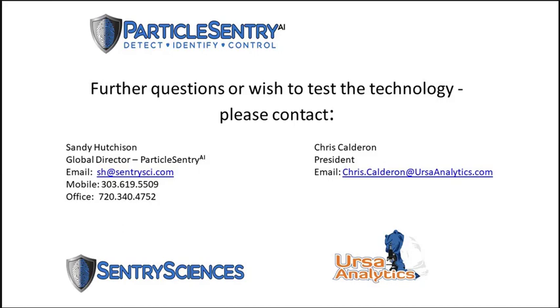One of the themes of this talk was I tried to use the dog and cat analogy and then showing how complex the morphology is in these images. Even subject matter experts have a really hard time finding good quantitative and automatic features that are embedded in the images to make decisions on. So this technique is a really systematic, consistent way of assessing the particles that are coming out of these images. Even though they might be hard for a human to interpret, this is an algorithm that is going through and processing in the exact same way. It's not like someone gets tired in a visual inspection type thing where humans are looking at this. This is a completely digital automated technique, and we see that being an advantage over humans looking for outliers.